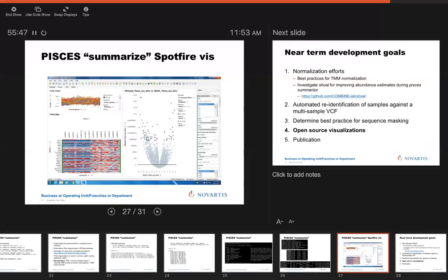Our visualizations are pretty standard. Again, Spotfire is a blessing and a curse, but having this pipeline allows me to go from unprocessed individual RNA-seq libraries to a summary matrix and visualization in these templates that I've created in less than an afternoon, like maybe 2 hours, including the hands-on time for loading everything into this template.